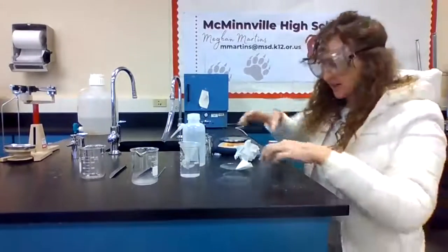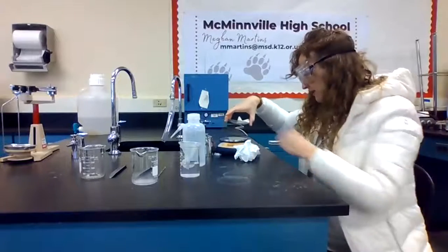Actually, before we start drying, let's get an initial weight.